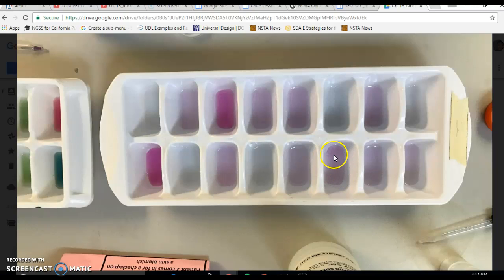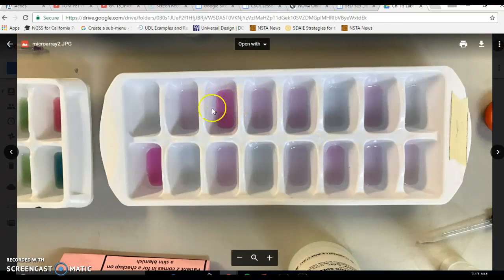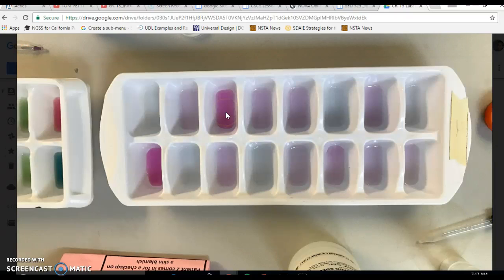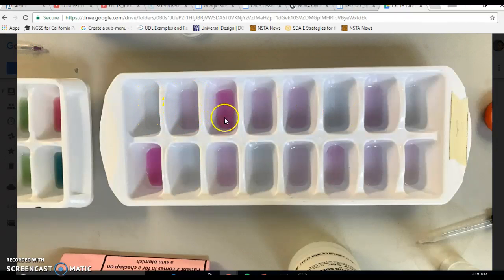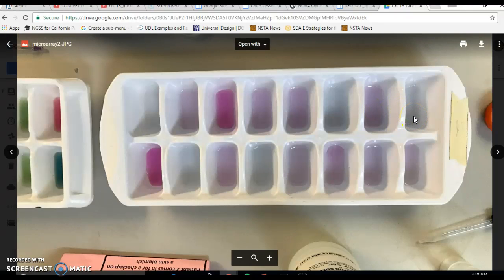This pink is darker than this pink. Is this pink dark enough to be considered a highly active gene, or must it be this dark to be highly active? Now, while some might argue that yes, you can identify this clearly as normal functioning, silenced gene, highly active gene, silenced gene, normal functioning, silenced, normal functioning, etc.